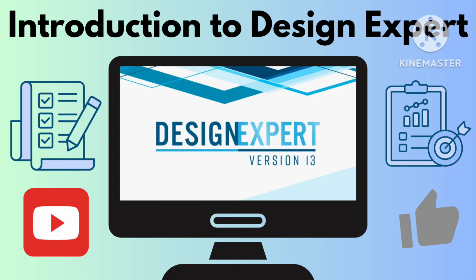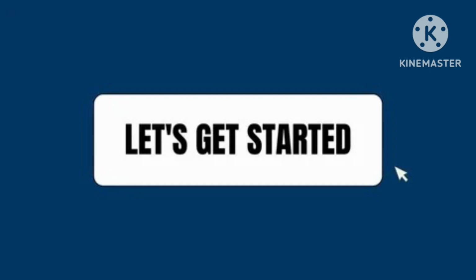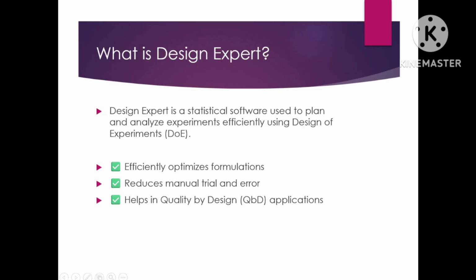So in this video, I'll take you through what is Design Expert, basics of design of experiment, then how to set up an experiment step by step, how to analyze results and optimize your formulation. So if you are new to this software, don't worry, I'll explain everything in simple terms. Let's get started. First, let's talk about what Design Expert is.